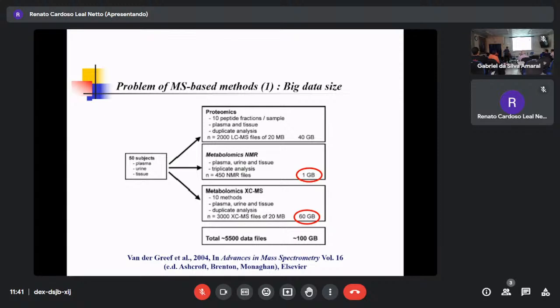And also another problem is nowadays, the data processing method is developed. The problem is every day a new method is coming out. Now, to save your space, you have only processed data saved. Today I found a very nice algorithm, but I don't have the raw data. This is a problem. The issue is how to store the data at a smaller scale.